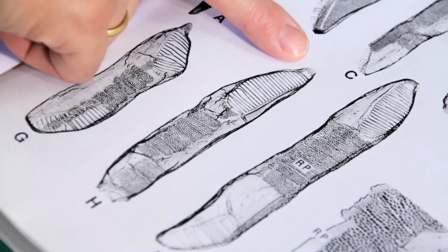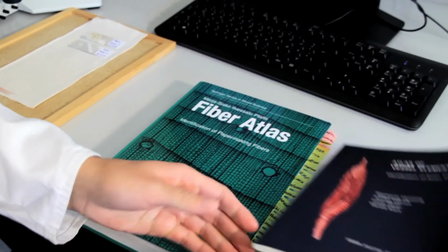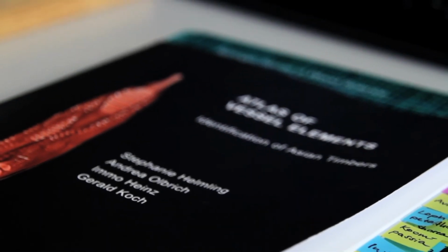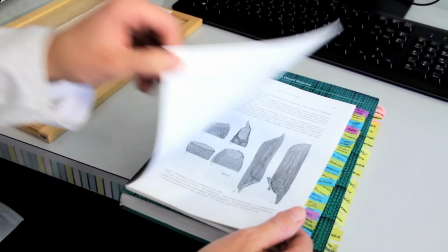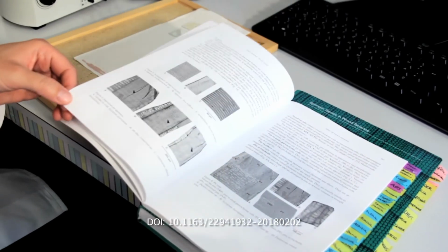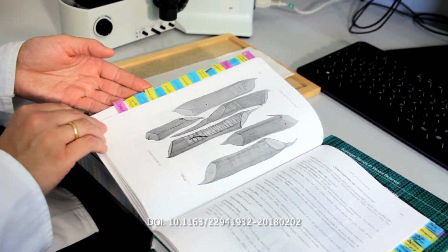The standard work, Faseratlas by Ilvessalo-Pfäffli, was supplemented by the Atlas of Vessel Elements with important references to identify Asian timbers. Therein, you find a detailed introduction to the key features important for the identification of fibrous materials. This link allows you to download the atlas for free.